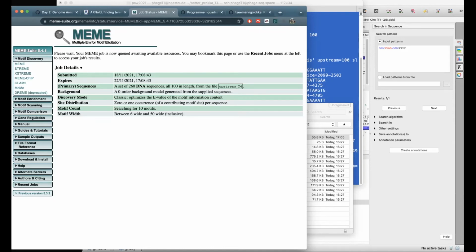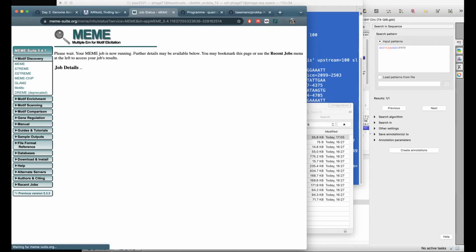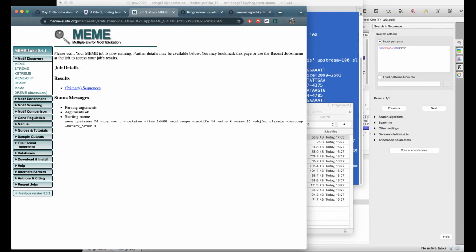have a look at the chat. Melinda asks, why is the terminator definition valuable? It is a good question. It will actually allow you to refine your coding sequence predictions and start sites as well, because once you have predicted all the terminators, when you have a terminator here, your coding sequence shouldn't run necessarily into that terminator, for example.